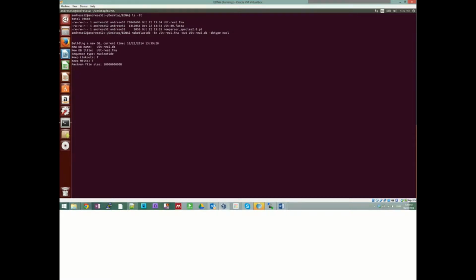Okay, perfect. Now it's running. I think if you copy and paste, it's copying some blanks. So now it's formatted as John did. So now we can run blast.